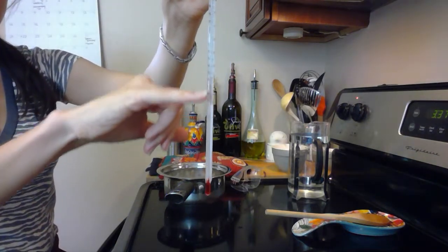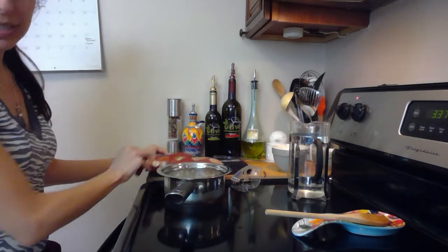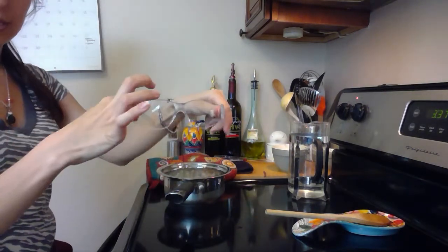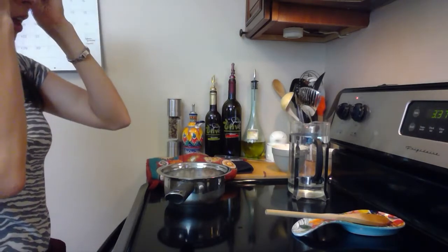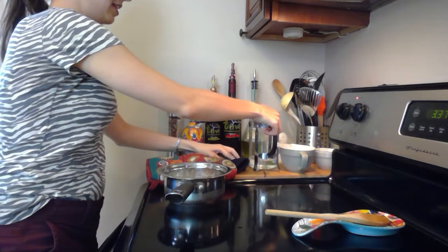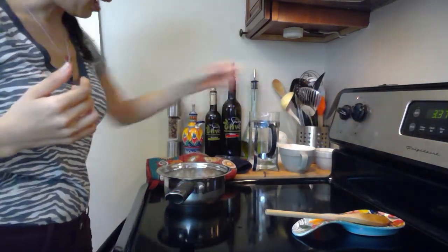So again, we're just looking at where our red line stops. You might have a different color. And you can place that back on your towel. All right, safety goggles on. And then you're going to turn your heat source to a medium-high heat, whatever that looks like for you, about a medium-high heat.